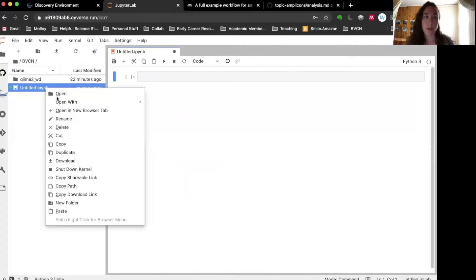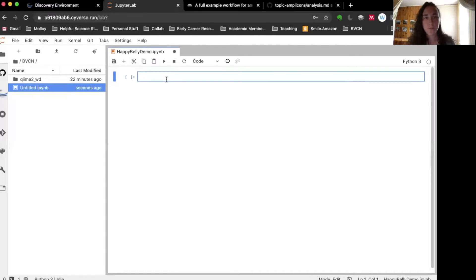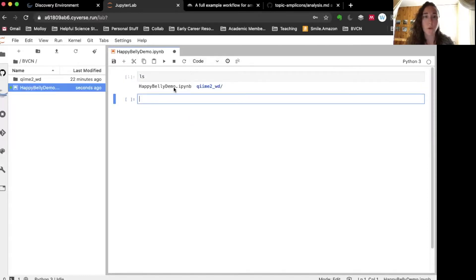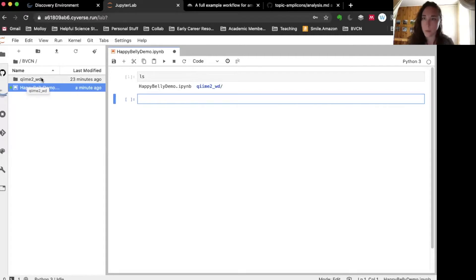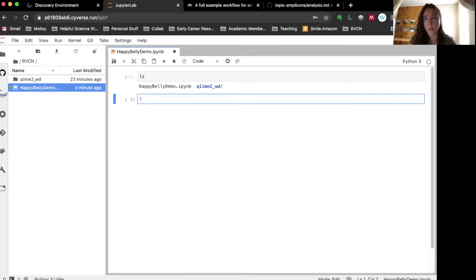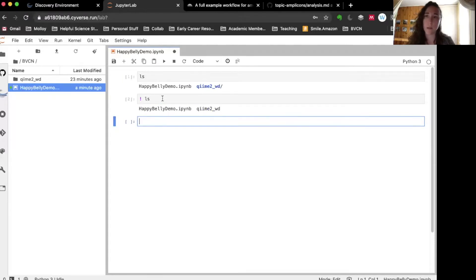The first thing you probably want to do is name your notebook — you can rename it just like you're working in a normal file system. Let's call it 'happy belly demo.' Navigating a Jupyter notebook: you have different cells where you can implement code. If I wanted to run a line of code that just lists the files in our file system, it will show you what's there. The command 'ls' in this case is a Python command, but you can also call bash commands in the Python environment by using an exclamation point.